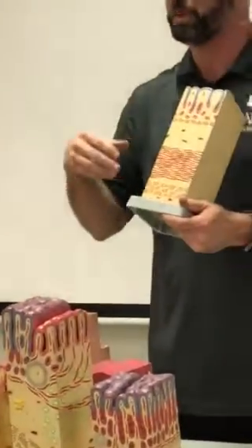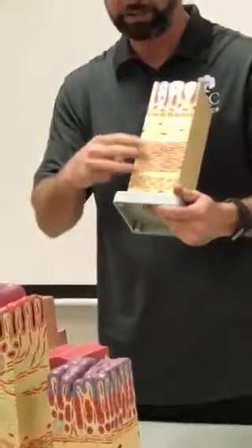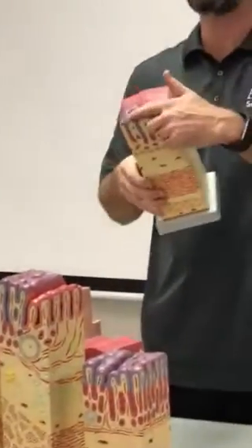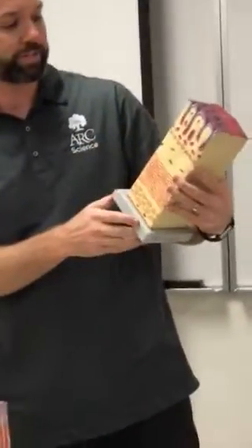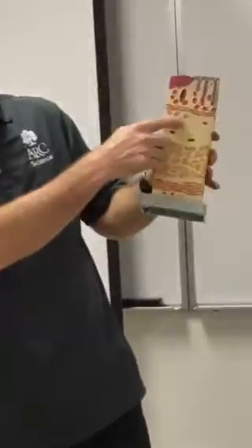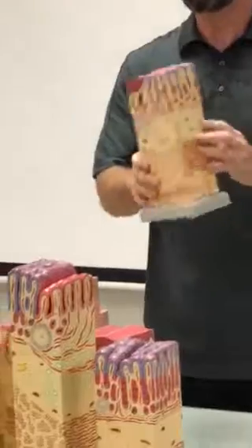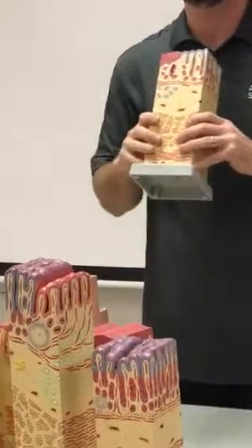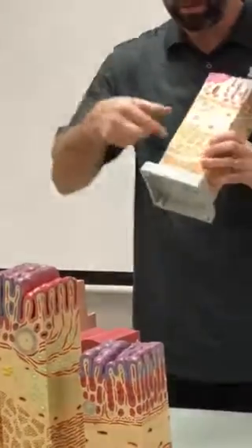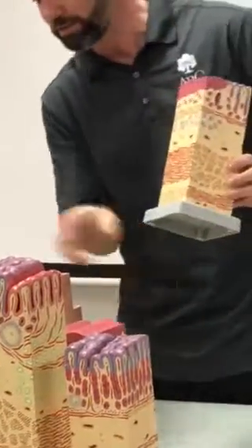We don't quite yet have all three layers of externa, so just a circular and longitudinal. So don't let the fact that there's not three there make you think that this can't be stomach. We're just transitioning into the stomach. So we are beginning to see some gastric glands. And you're seeing the submucosal glands disappear. Right? There are no submucosal glands in the stomach. What would you call the junction between the esophagus and stomach? Cardiac sphincter. And you do have a relatively thick layer of circular smooth muscle, just not as thick as the pyloric sphincter.